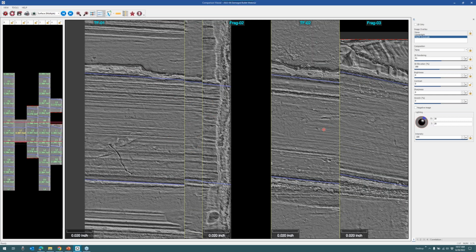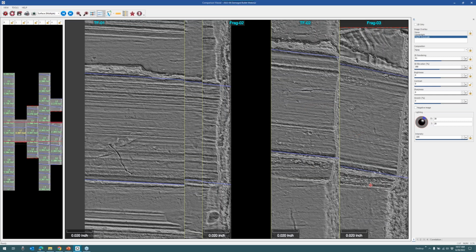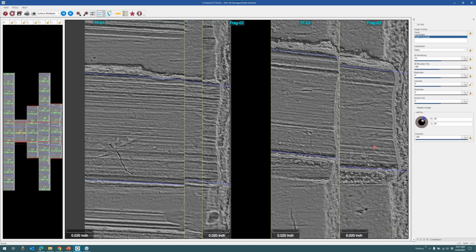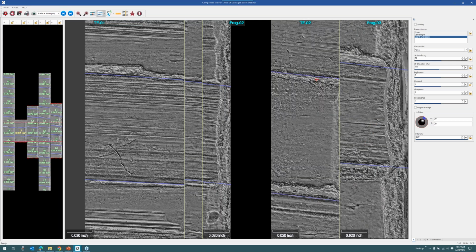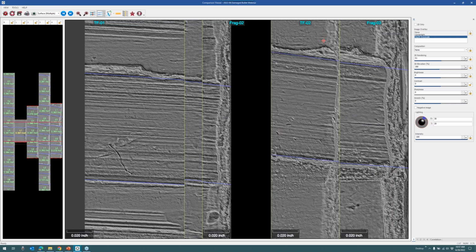And independently now, I can actually do some work here. Let me take fragment 3. I know that fragment 3 has a very well-marked feature here in the middle of that land engraved area. And from there, I can go and try to find that same feature. That's not it.